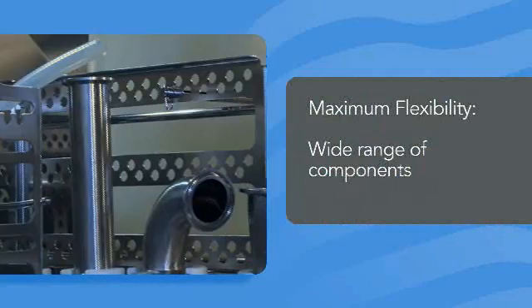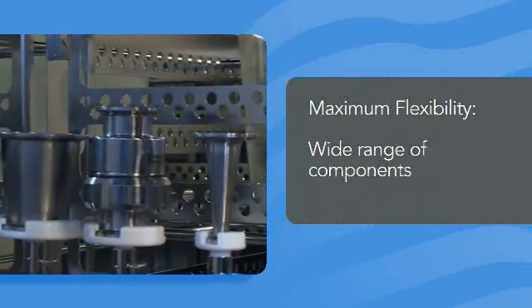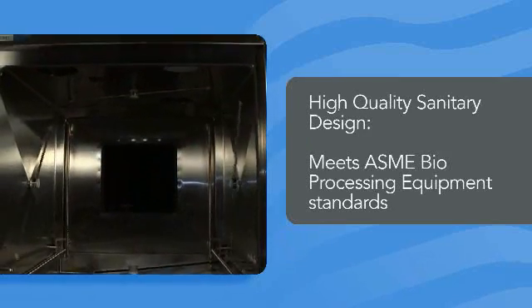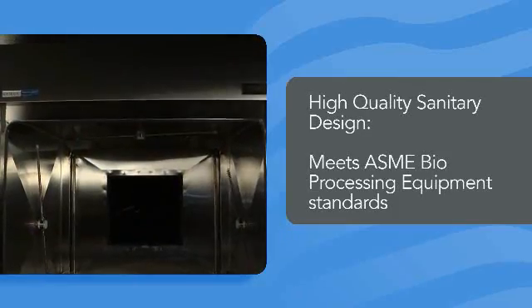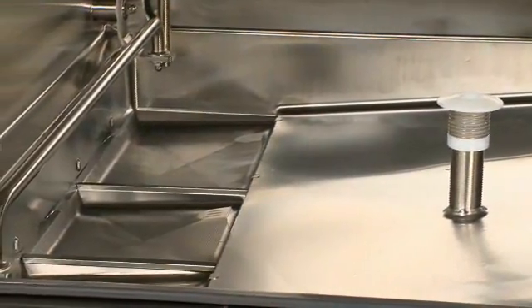Our modular loading accessories can be configured easily to accommodate a wide range of components in the same load, optimizing productivity and turnaround time. The 680PG washer's sanitary design complies with the ASME Bioprocessing Equipment Standard to prevent the risk of cross-contamination between loads. All welds are polished to achieve a high-quality surface finish, and dead legs are limited to the strictest minimum.